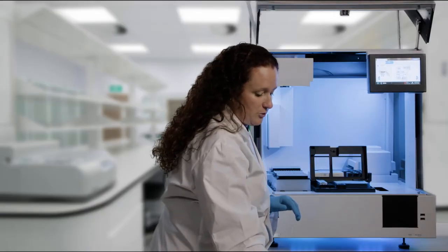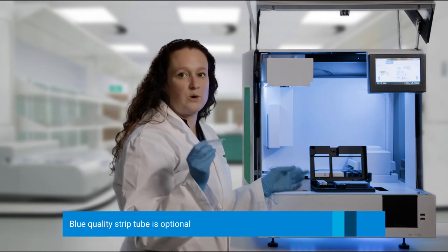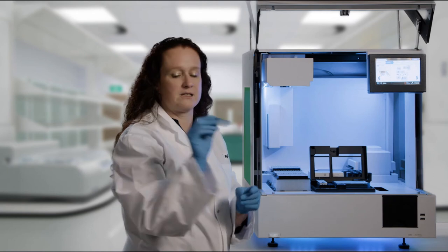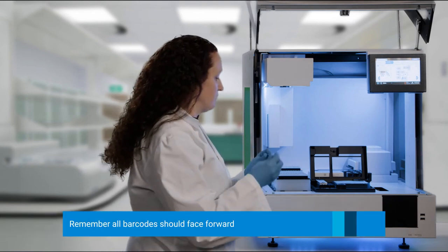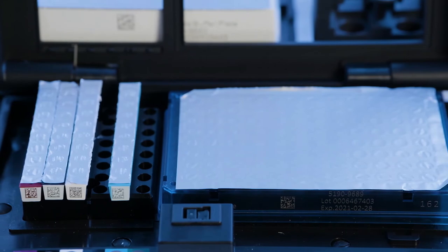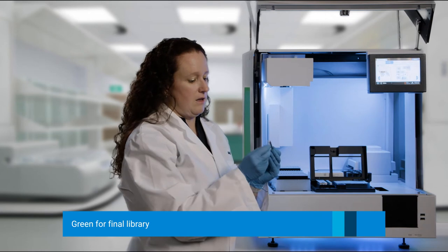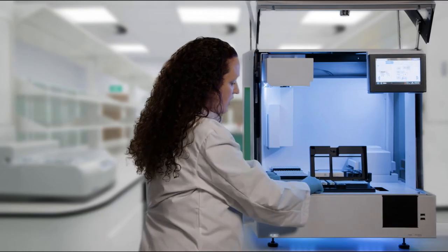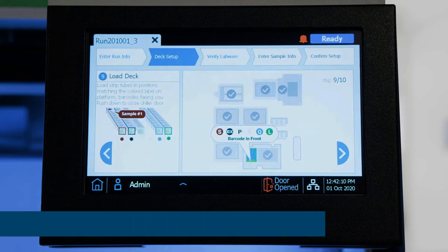Now you have two strips to add. You have a quality strip that is optional — we indicated when we set up this run that we wanted intermediate QC aliquots, so this strip is required. If you don't check that box, you don't need to add this strip. Barcode towards you, added into the fifth position. The last strip is the green strip for your final library, barcode towards you, added into the sixth position. So you have three strips, skip one, then two strips — that's how the diagram shows on the Magnus.